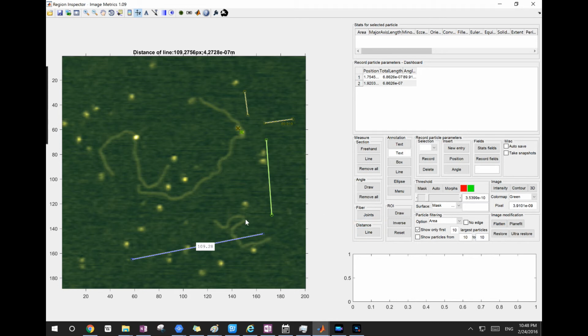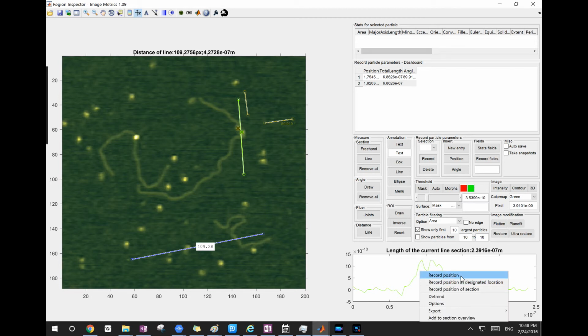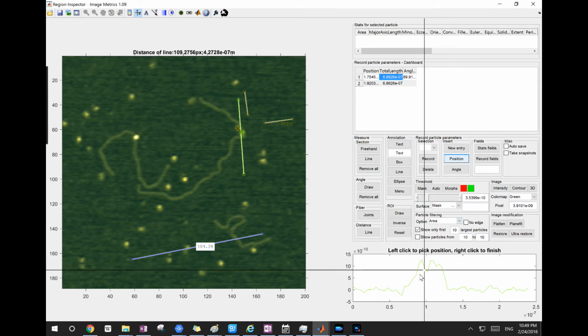And once you have that, for example, you can move the second line. So let's do this. You can also take measurements, so we already know there are 3 ways in this manual to measure the position of the peak. You can also click the position here. That will insert a new line in the table. If you want to replace the position measurements in, for example, line 1, you can just simply select that row. Just click any cell in that row. Then you say position, click that, and then you can check a position.